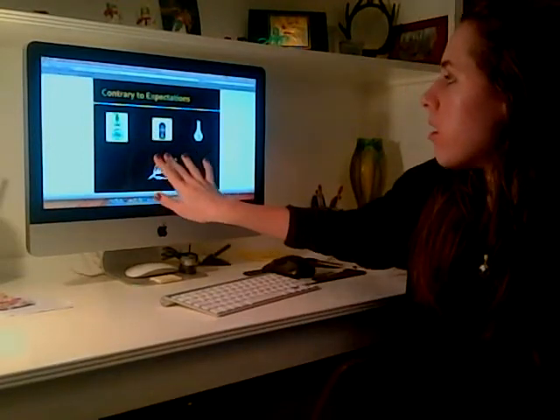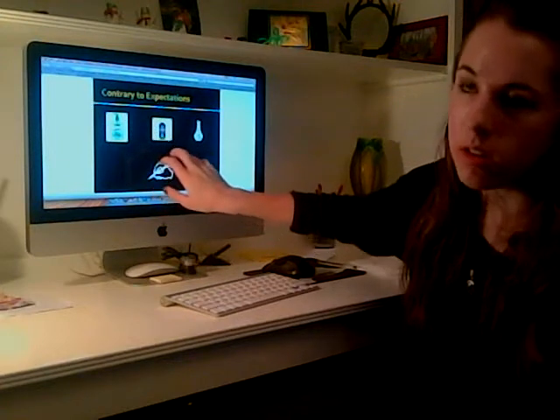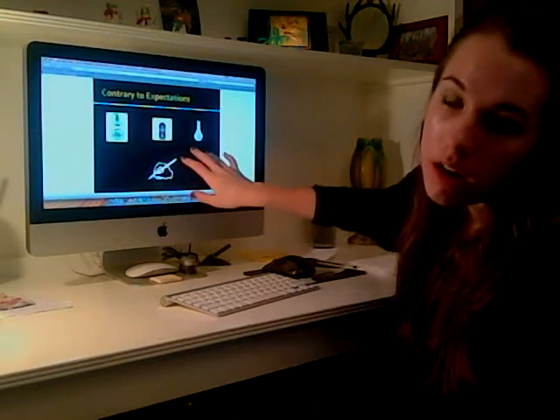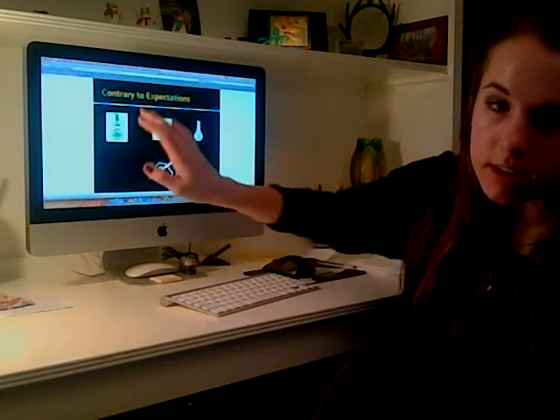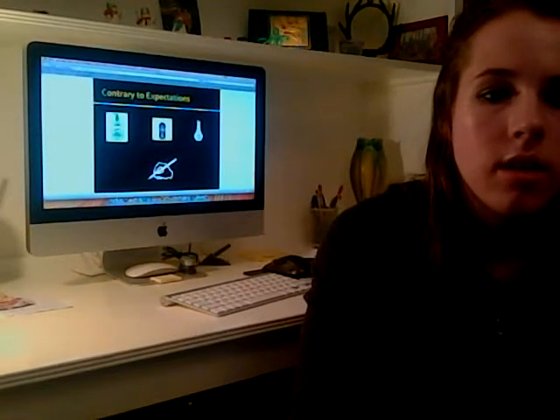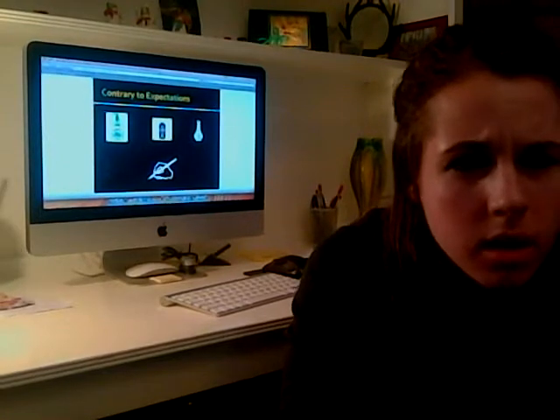Also, these three low measuring zone of inhibition agents all use alcohol as their main ingredient, which may call into question how effective that is.